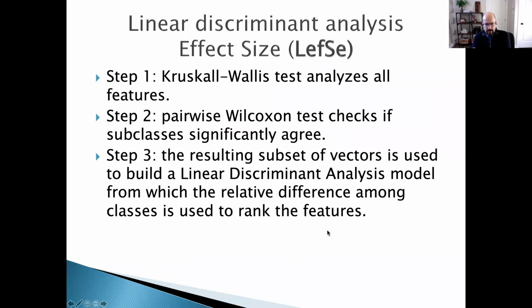I'm not going to go into details about the statistical analysis, but it first shows a statistical difference in abundance, and then it does one type of test that predicts if those that are statistically more abundant have any biological importance, if they are what some people call markers for good intestinal health or for whatever you are evaluating for the use of antibiotics.